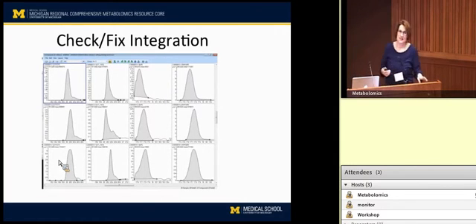So, all right, but when we get to real samples, sometimes things aren't quite as simple. And you can see here we have isocitrate and citrate, which don't separate on the HPLC system. And so they pretty much come out as one peak. And you can see here they're starting to separate a little bit. And so there are some decision points that the analyst has to make at this point to say, how are we going to quantitate this? And in this case, we would quantitate the entire peak, even if it starts to separate, and manually integrate this if we need to. And when we report it to you, we do report it as citrate, isocitrate.